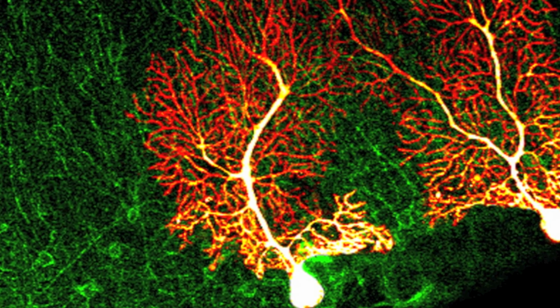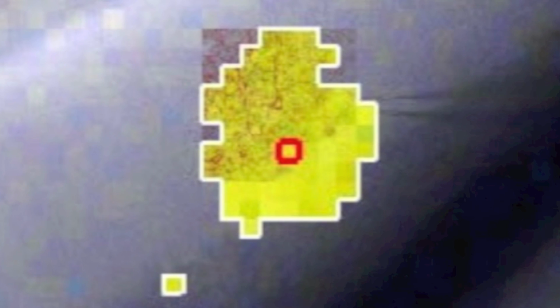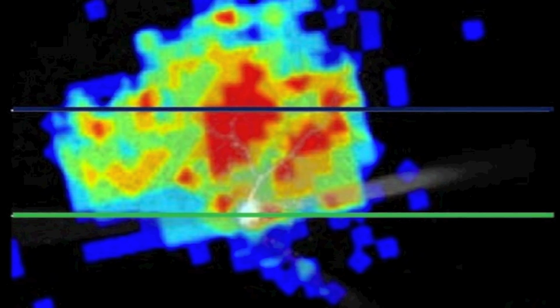We focused laser beams using the microscope onto the slice, and because of channelrhodopsin, these laser beams were able to activate these interneurons. And while they were activating these neurons, we were recording electrical signals from the red cells, the Purkinje cells. And this is how we were trying to map the cerebellar circuitry.